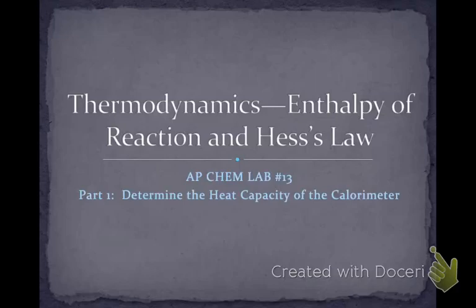Today's video will cover the procedure to determine the heat capacity of the calorimeter for the Hess's Law Lab. I'll also be giving you data for part 1, and hints to work on the calculations for part 1. So it might be a good idea to have your lab handout ready so that you can follow along with the procedure.